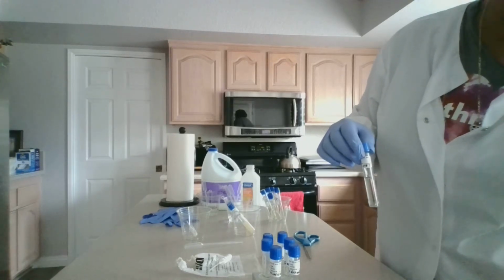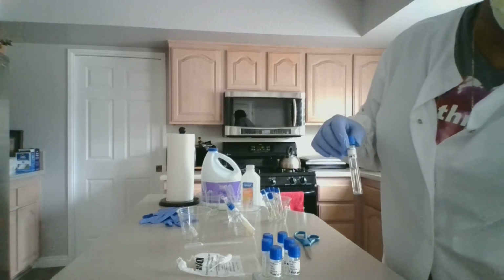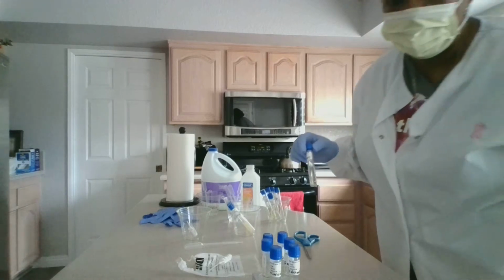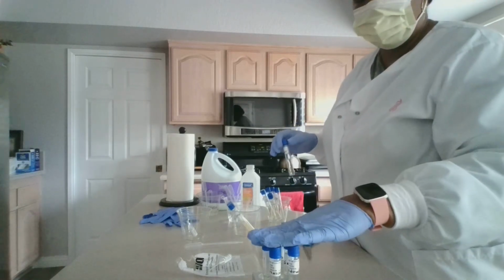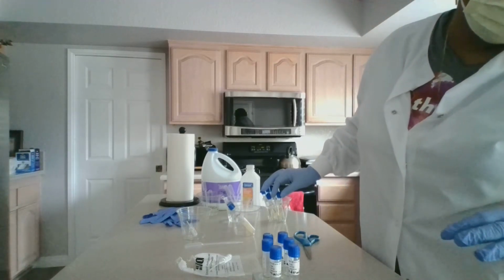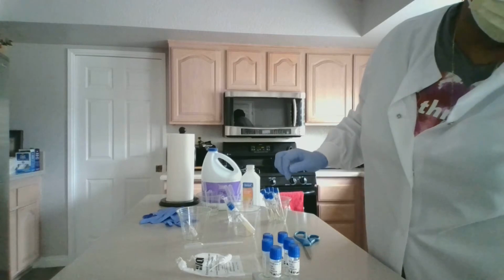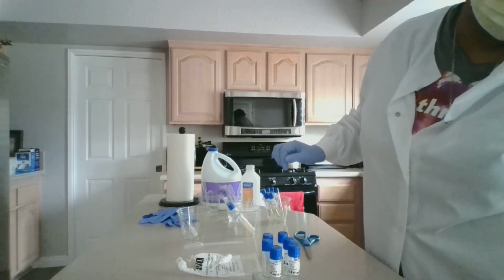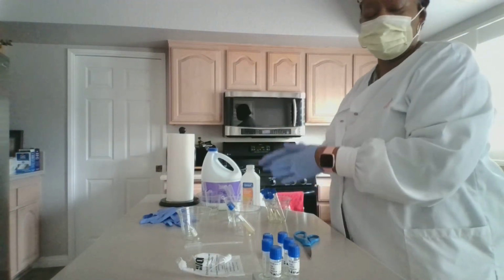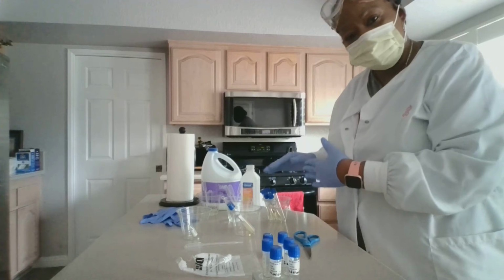And then once I'm done with those, I'm going to use my active culture for each, and then place the 6 newly prepared pH broths into my incubation location for 24 hours. These are for 48 hours, and these will be going for 24 hours. And if I don't see any turbidity growth observed in 24 hours for these, I will put them back in incubation for another 24 hours and see what my results are. And I will document my results and put it into my lab report.